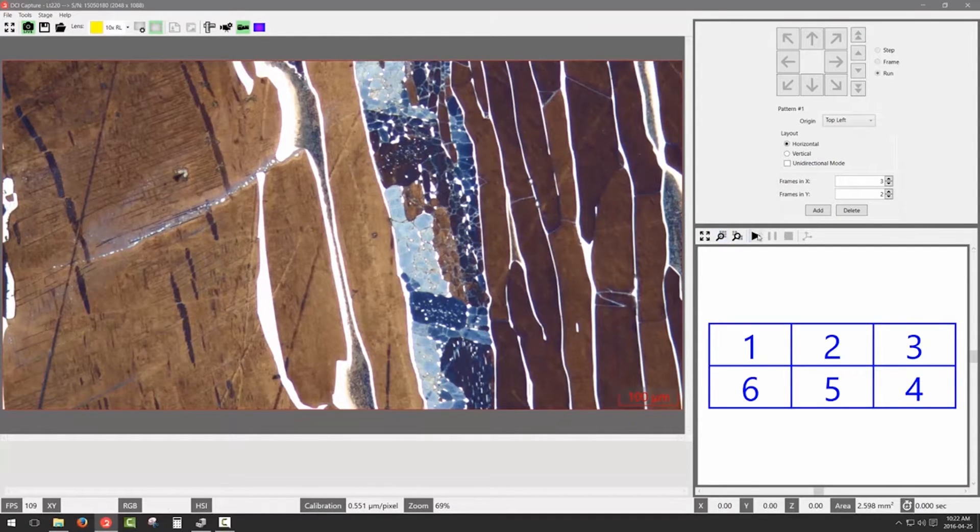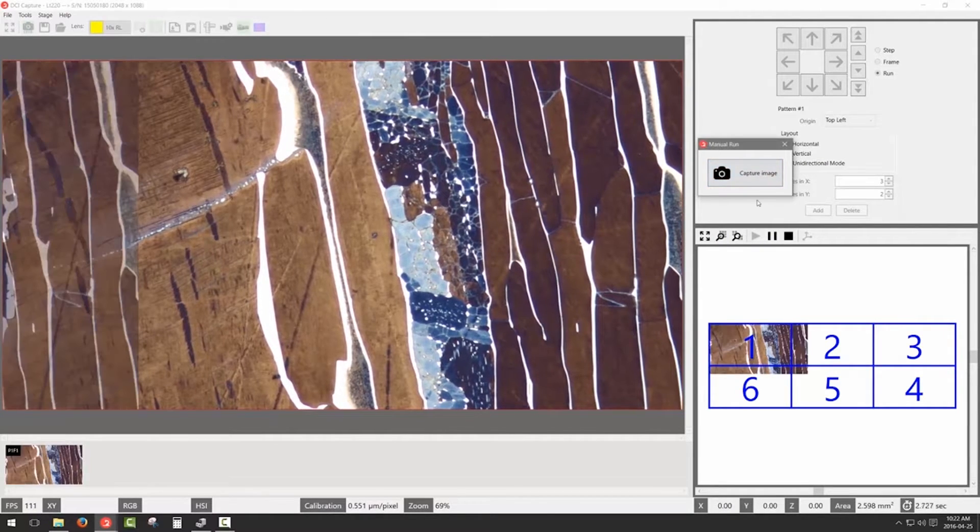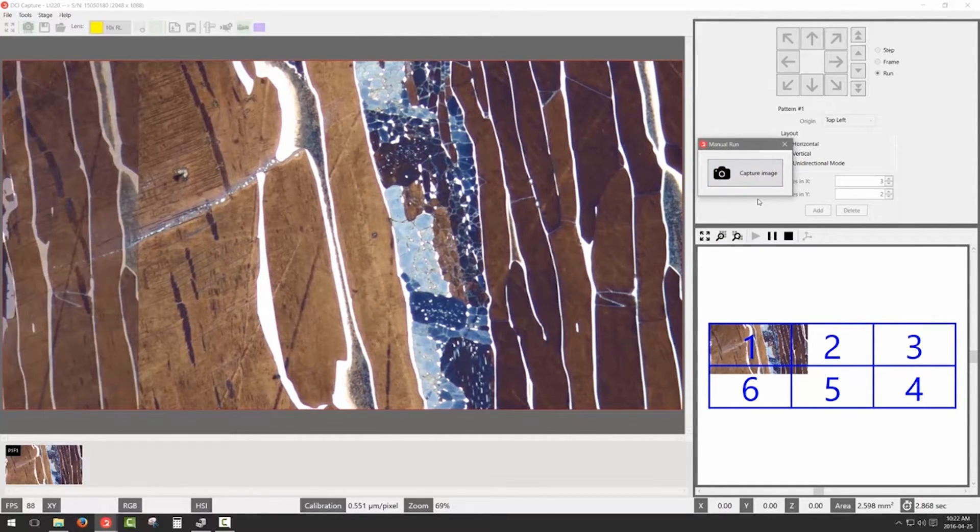Each time you grab an image, you will see it appear in the Stage Pattern window on the bottom right corner of the screen.